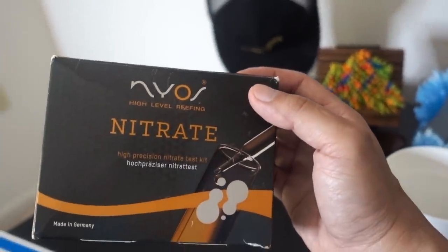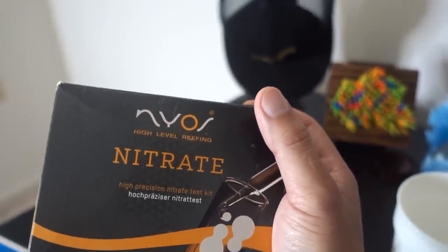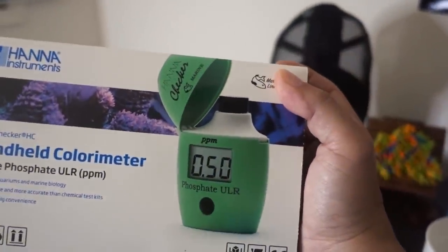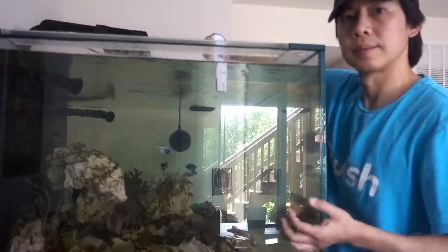We're going to start with the NIOS nitrate test. This is really easy to use, and the color differences are easy enough to tell apart, not like a lot of other test kits that are really difficult to read. And we'll follow up with the HANA phosphate low-level handheld test kit to see where the phosphate level is. As you can see, we've got a full schedule of testing ahead of us — since I've done a water testing video before, I'm not going to bore you with all the little details again, so we're just going to cut right to the results.